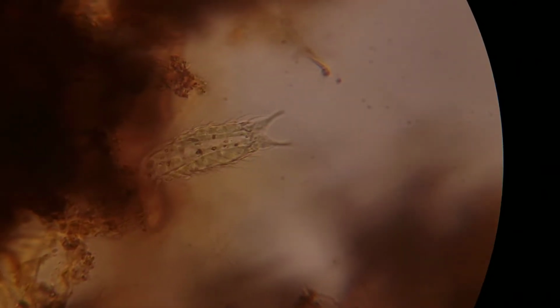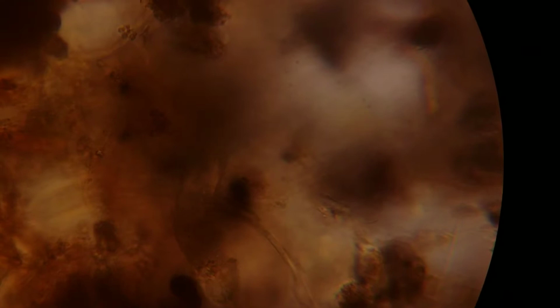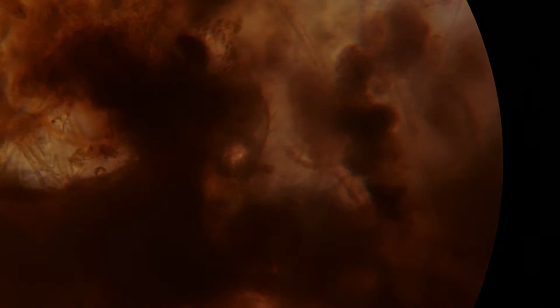This is, I believe it's a gastrotrich. Or it could be another species called a chaetonotus. But I would say gastrotrich. It's hard to say. They're tiny too. We're zoomed in. What magnification am I on here? So that's my 40 times 10. So I got 400x here. Let's see. Cool. He would be much clearer if he wasn't behind that debris.